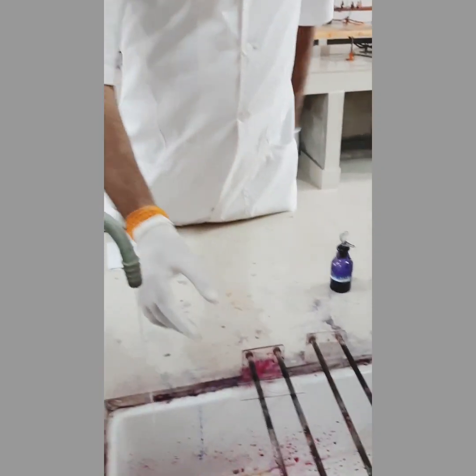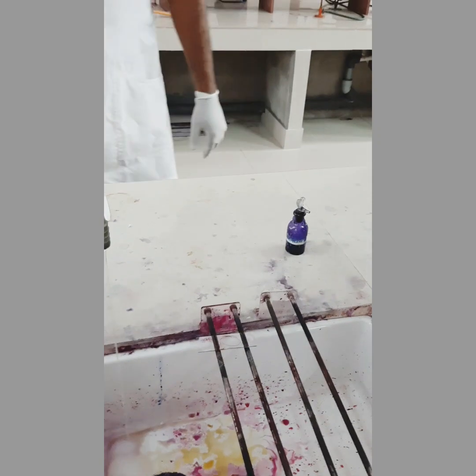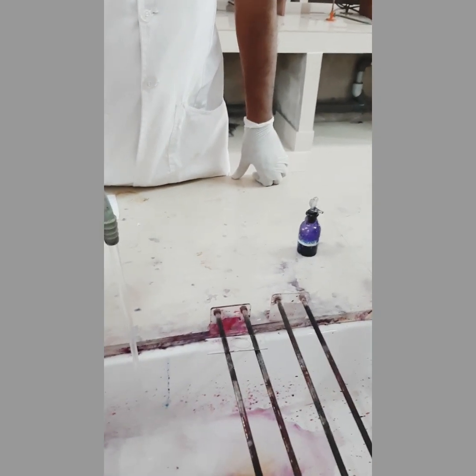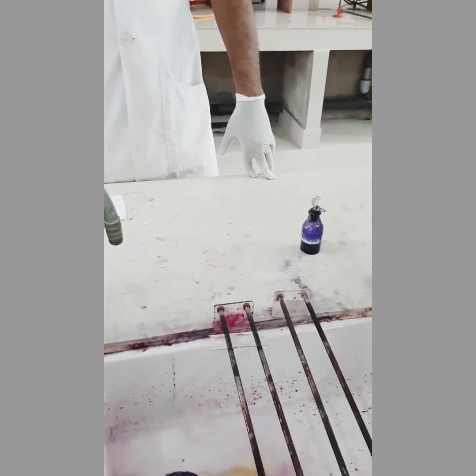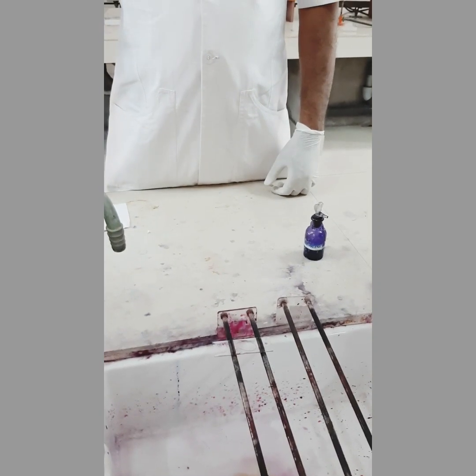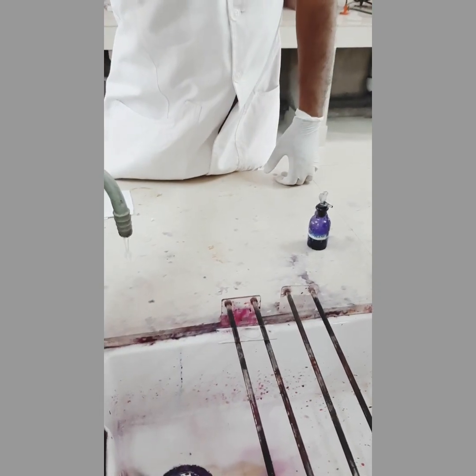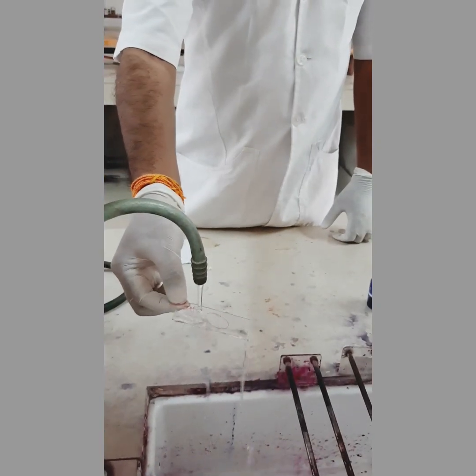If any pink color is retained, decolorize again with 20% H2SO4 for another 2 minutes, so 5 minutes in total.